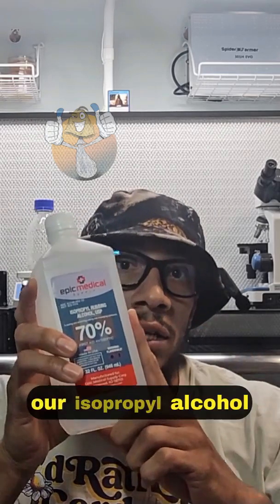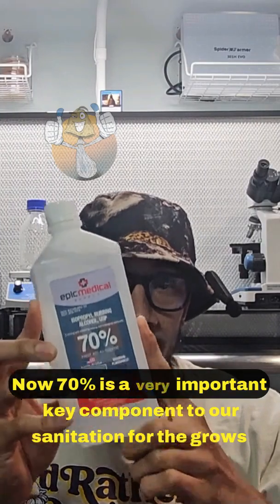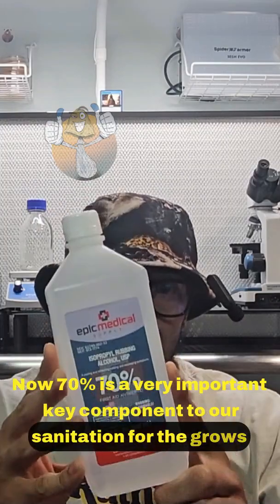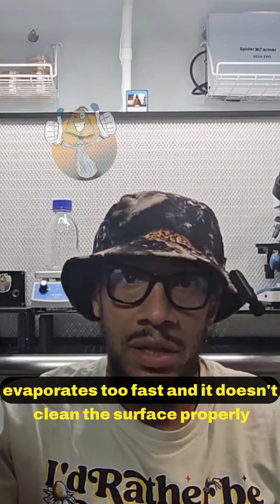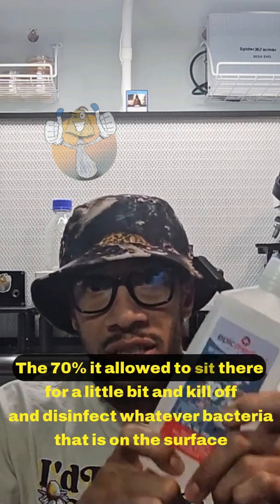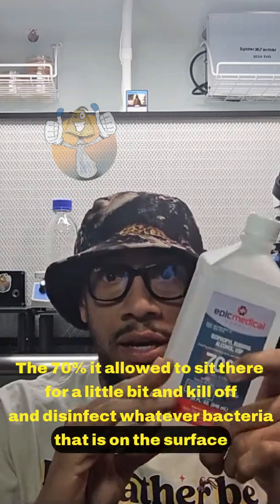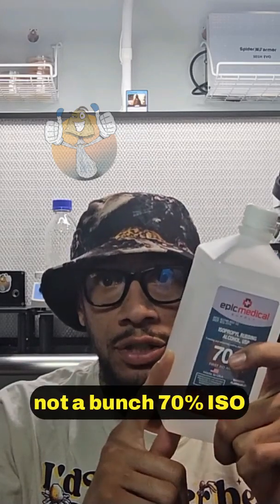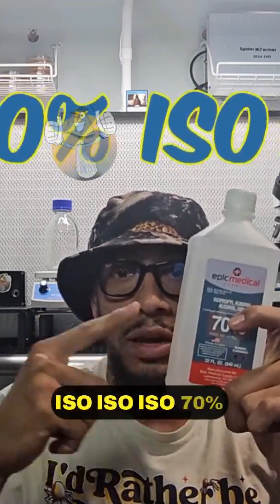Number one: isopropyl alcohol 70%. 70% is a very important key component to our sanitation for the grows. 90% and above evaporates too fast and doesn't clean the surface properly. The 70% allows it to sit there for a little bit and kill off and disinfect whatever bacteria is on the surface. We want to focus on growing one fungus, not a bunch. 70% iso.